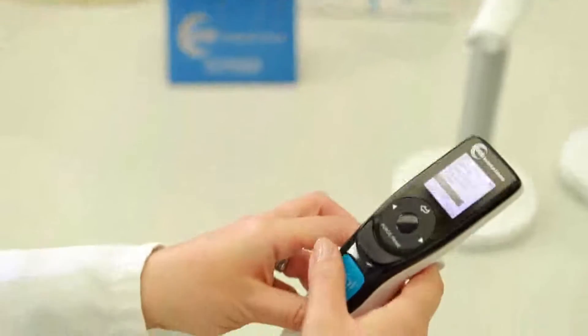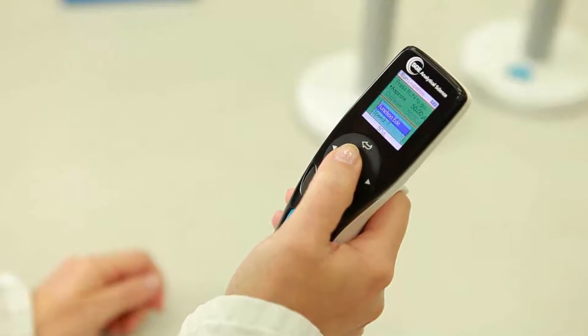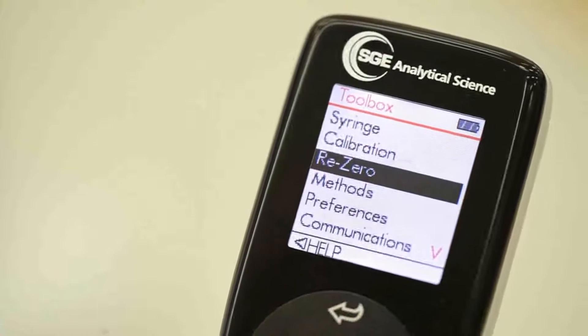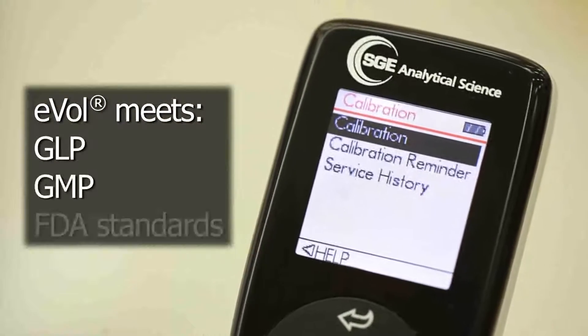The device is ergonomic, comfortable, easy to use, and easy to calibrate. In fact, calibration factors are saved for each syringe, enabling laboratories to comply with stringent global laboratory standards.